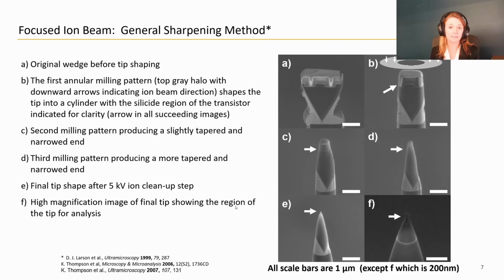Now, for advanced sample prep, sometimes we need to do that with semiconductor materials. We can also prepare things in a planar or cross-section view and also approach the sample from the backside if we are trying to avoid different regions in our sample. So there's a lot of options on sample prep, but generally the way these are made for electronic devices is with a dual beam FIB.